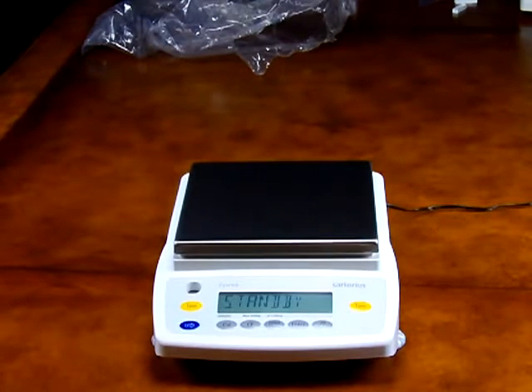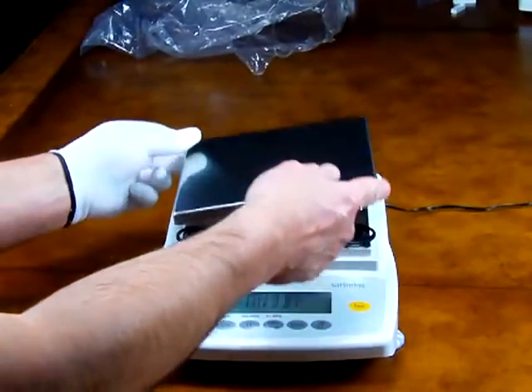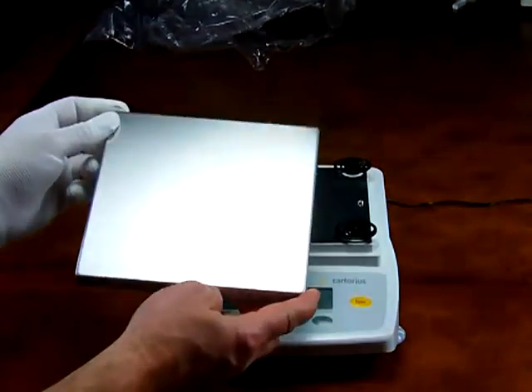Welcome to Precision Weighing Balances. Today we'd like to introduce you to the Sartorius GW6202. This precision top load balance offers 6200 grams by 0.01 gram readability. The balance features a large 7.1 by 7.1 inch removable stainless steel platform.